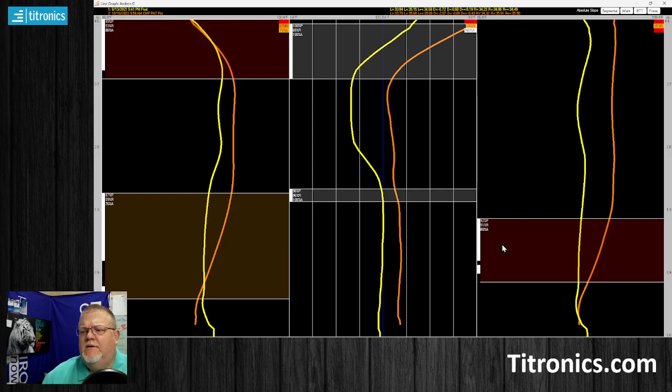The easiest way to understand the 3: the absolute slope is, is there one, and which direction does it go? And then what's the corresponding slope there? So you can see right here, we have both of these angled to the right. So there is a slope and they're both angled to the right, so the absolute slope is 100%. The relative slope has to do with a composite of all of the tangents here. Is the slope the same, and how much of it is the same? We only have a 69% relative slope on this area here.